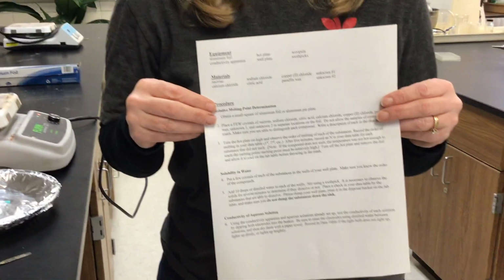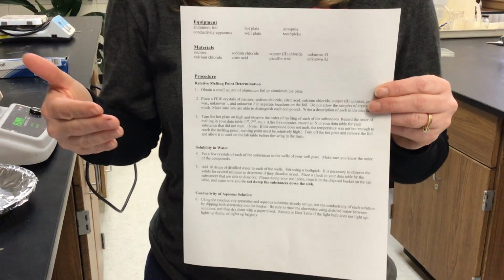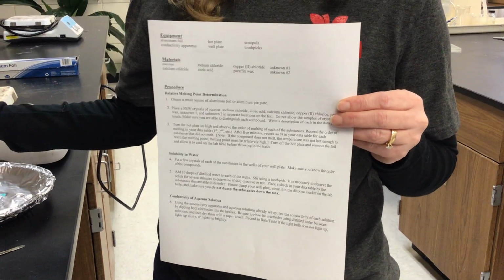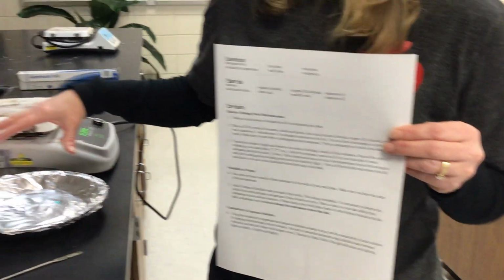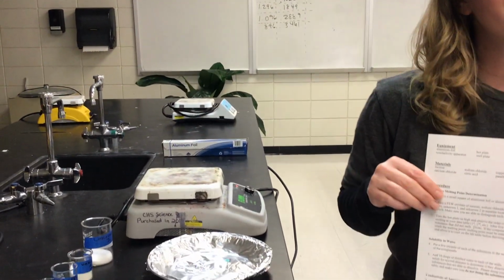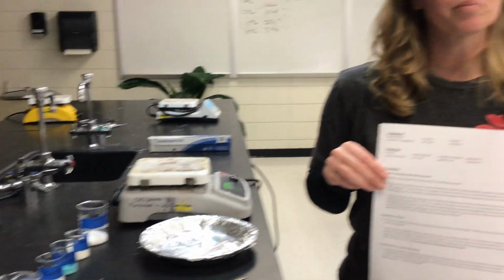Now I'm going to flip it over, and here you have the procedure of what we're going to do. We're going to start off where you're going to give me the physical description of what each one looks like. Then I'm going to put them in this pie pan, and there's 8 compounds, and then I'm going to stick it on the hot plate, and we're going to conduct the relative melting point of each substance, okay? And we're going to rank them 1 through 8, and then we're only going to wait about 5 minutes, and then we're going to decide after 5 minutes whether or not they've melted, okay?